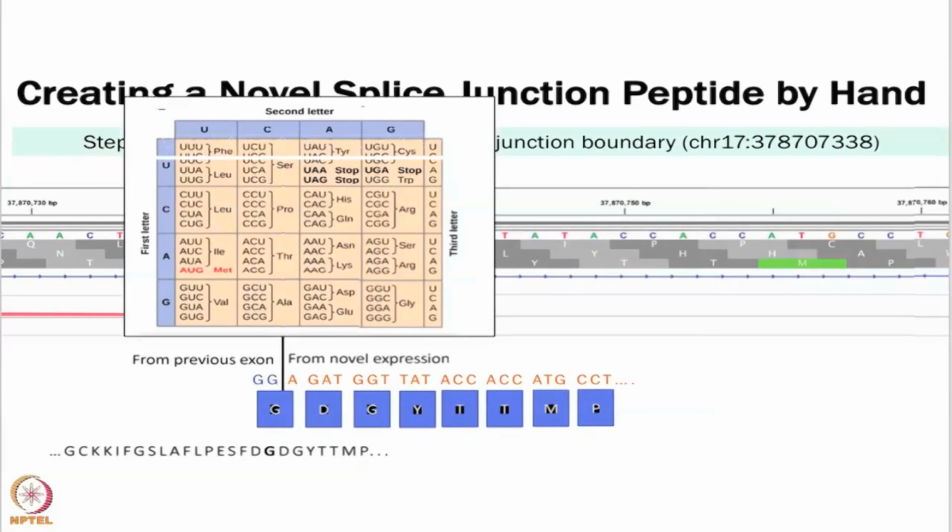Okay, those two ends are going to join. Here these are the stop codons. Since you have 3 frames, that's why one of the frames... and you're in an intron here, so none of this really matters. Okay, so this is an intron, right? If you zoom out, you won't see a stop codon in an exon.